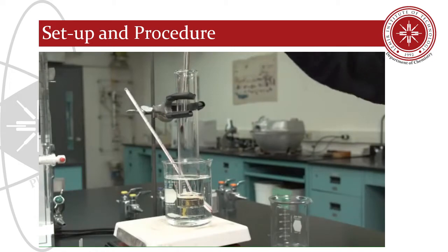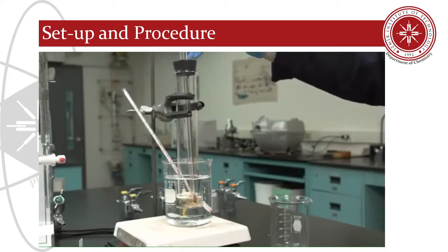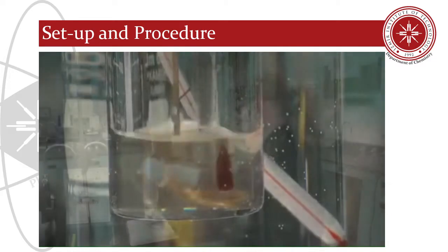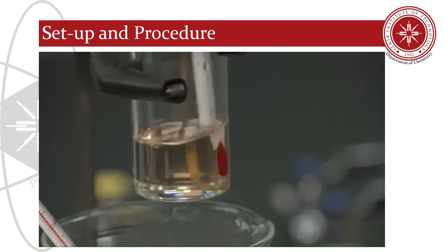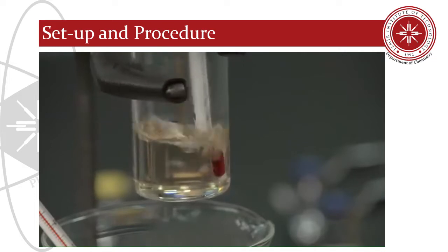The contents of the tube are stirred with a wire stirrer and heated slowly in the bath. Read and record the temperature at which the solution changes from cloudy to clear. Remove the tube from the hot water bath, stirring the liquid as it cools. As soon as the solution changes from clear to cloudy, read and record the temperature again.